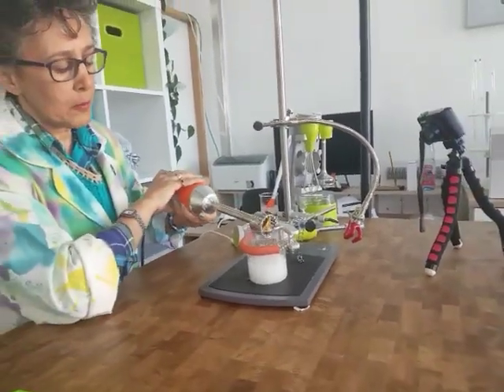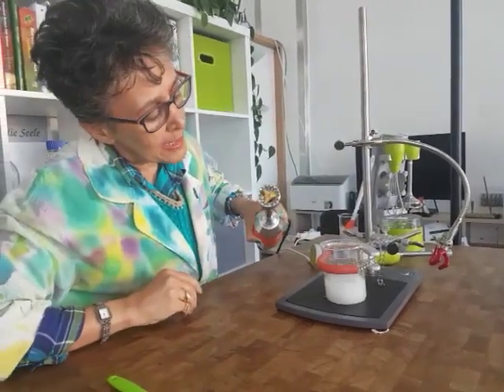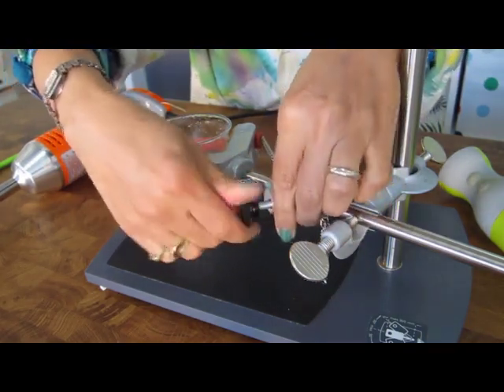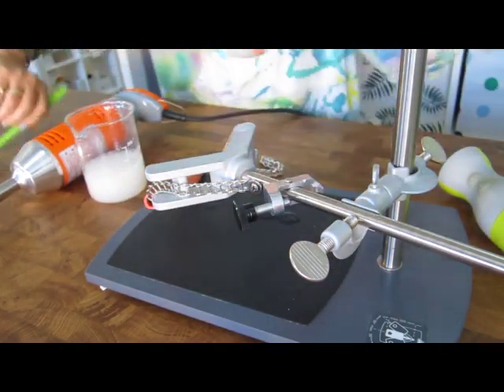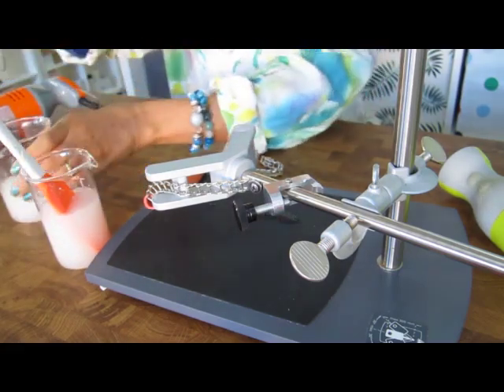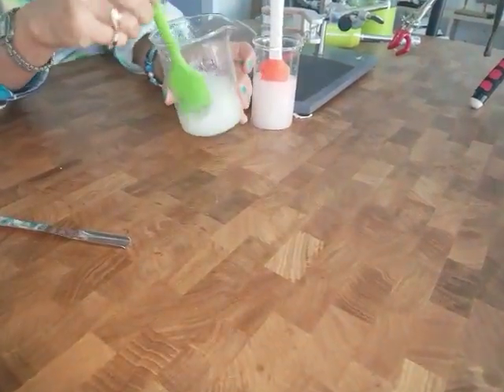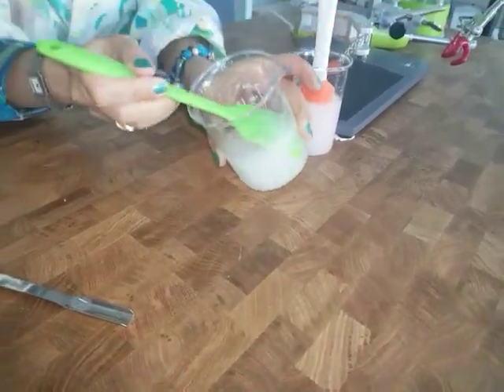It did a better job than Blendia for this concentration — it looks cleaner than Blendia. And this is how the gum dispersion looks. This is a 2% dispersion of solar gum in cold water blended with Dynamix, not at the highest possible speed. It's quite smooth and nice.